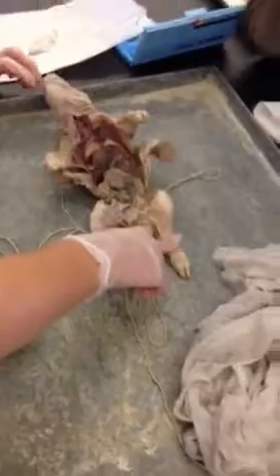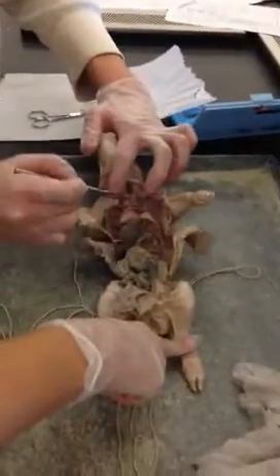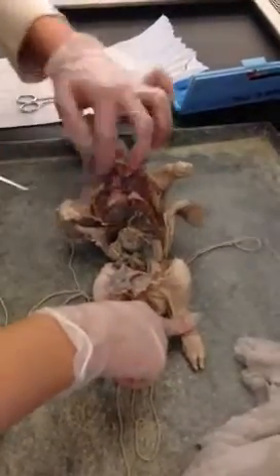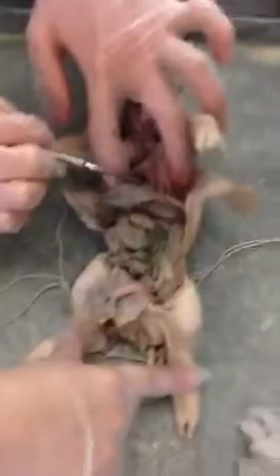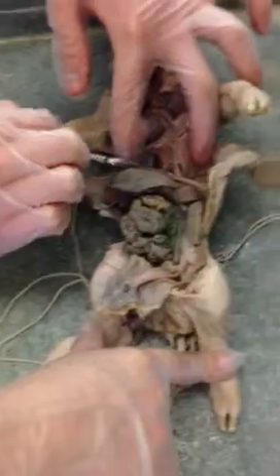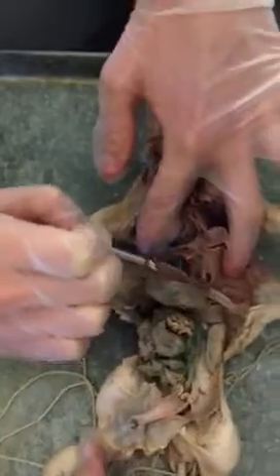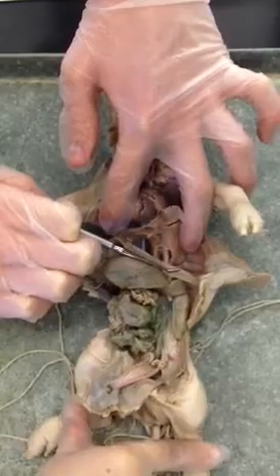Okay. Next page. Now we're going to move on to the digestive system. So we have the esophagus, which remember is located just behind the trachea. From the esophagus we go down all the way to the stomach. If you see here, the esophagus is that middle structure. Well, might as well just say while we're here that this is the vena cava, this is the esophagus, and that's the aorta. Alphabetical order, dorsal up.